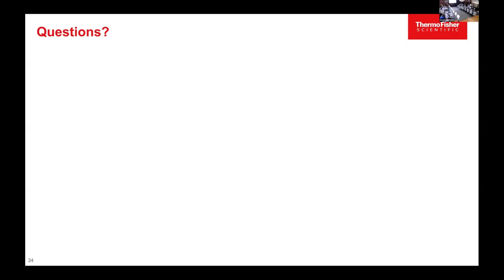I have a question. For the Ardia workflow, can you add custom components to that? Like, say, if I wanted to automate uploading to a repository? I'm trying to think of how. It can't be on the Ardia system itself. It's not customizable in that way.